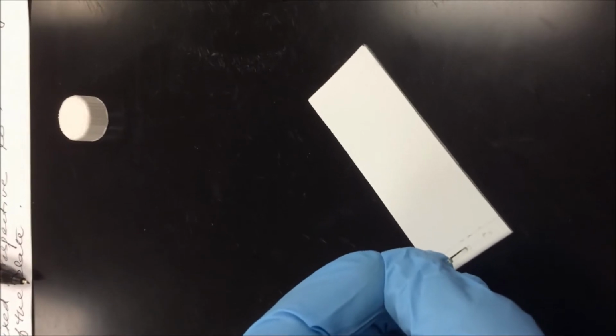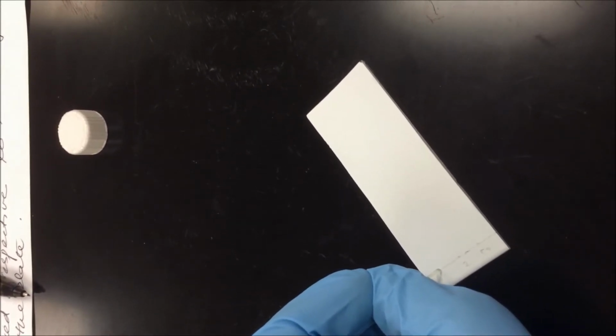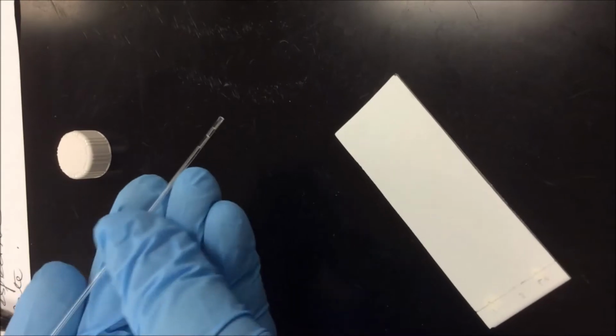So let's go ahead and spot our first sample, and I'm going to do that right here at spot number 1. Just 1 dot is enough, and then I'm going to do a co-spot for that as well. 1 is for my first component, which is 2-nitrophenol, and 2 is for the second one. Notice I haven't taken a whole lot of the material. I have taken very little of the sample, and I already had a second spot, so just 1 spot right there, and then do a co-spot.